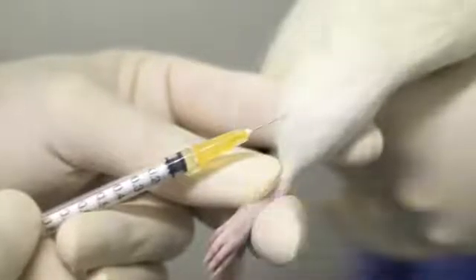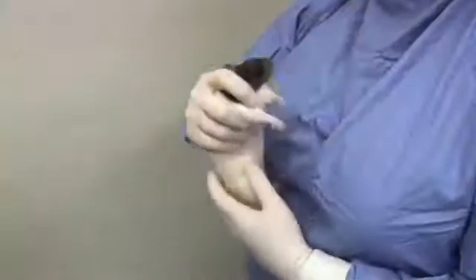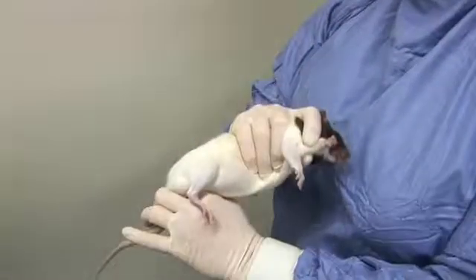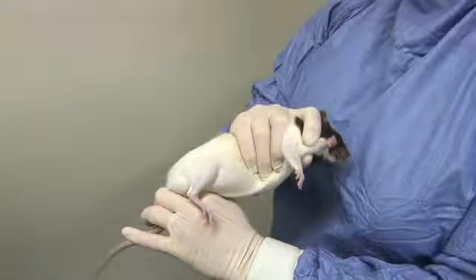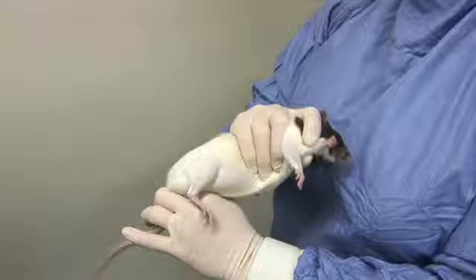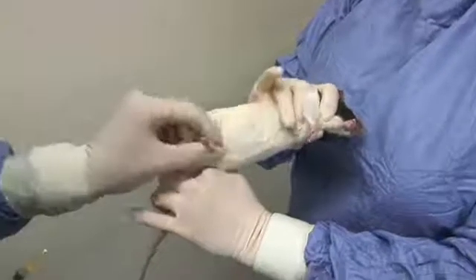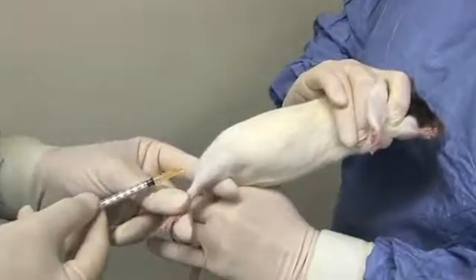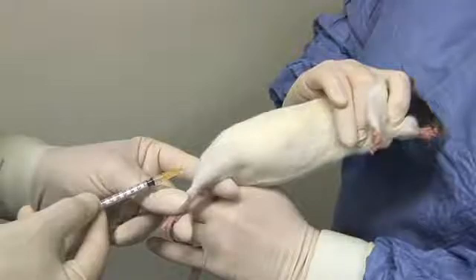Adjust your grip around the rat's shoulders so that your thumb and forefinger push one or both of the rat's legs forward, and support and restrain the rat by holding its hindquarters and one hind limb using your other hand. An assistant who will carry out the injection gently extends and restrains the other hind leg, supporting it with their index finger to prevent movement during the injection.